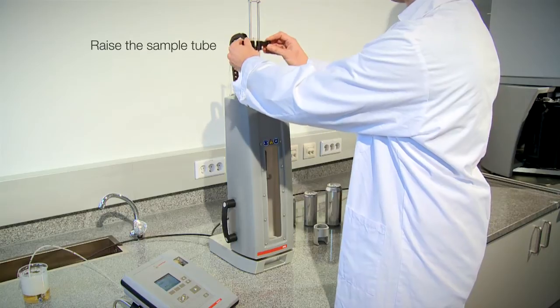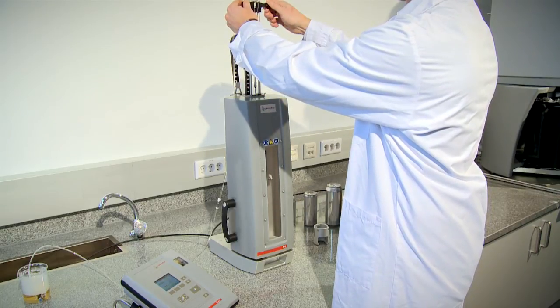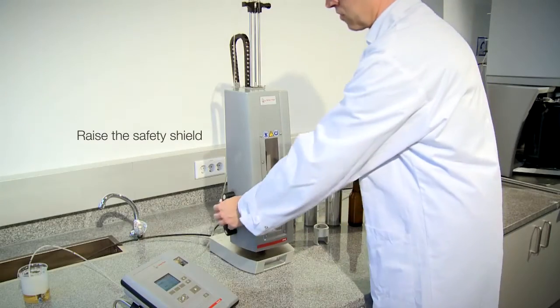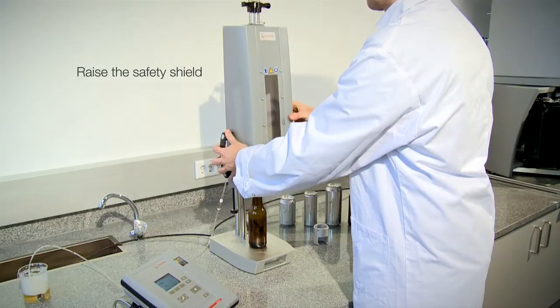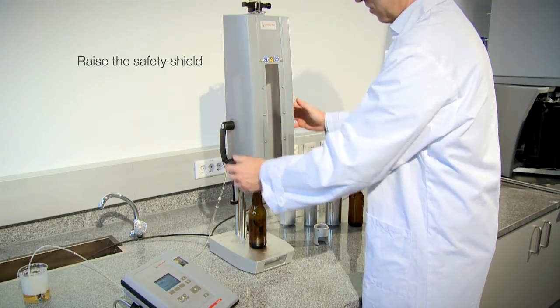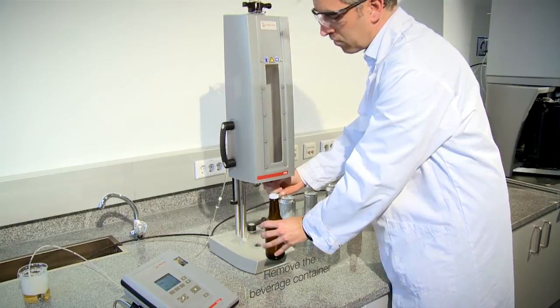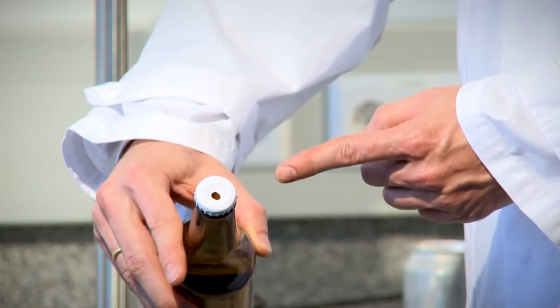Raise the sample tube and fix it in its uppermost position. Release the pressure. A gas spring causes the safety shield to rise. Lift the handle of the gasket holder and remove the bottle. The pierced hole is clearly visible.